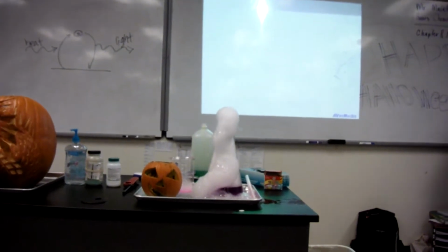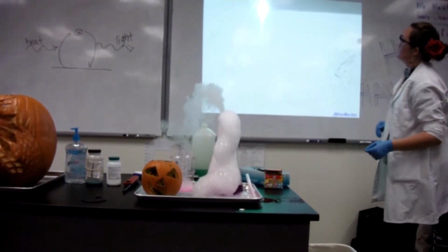Psychedelic. Okay, that seriously looks cool. Look at the side with the glowing bubbles. Whoa. Okay. So now, oh yeah, you guys have to answer some questions. Turn the lights on. Turn the page over. Psychedelic, bro. Gnarly. Alright, here's some questions for you.